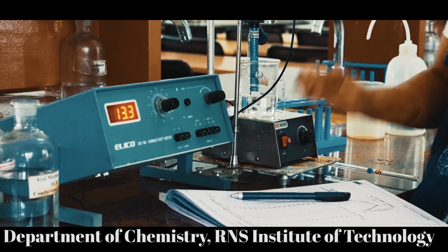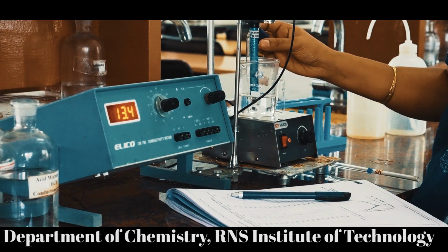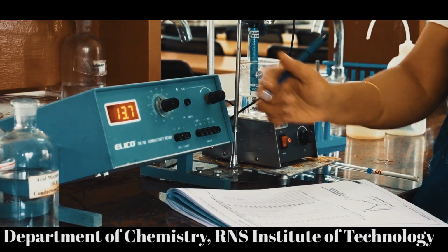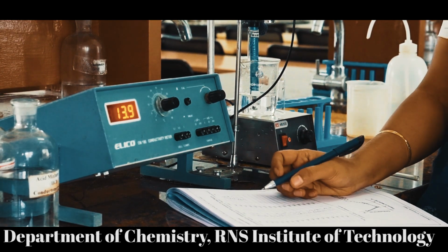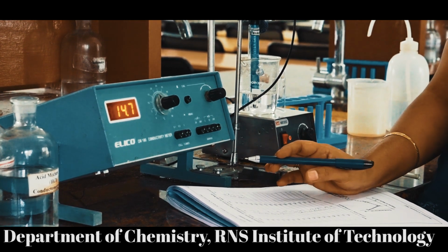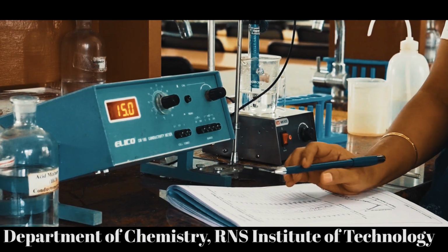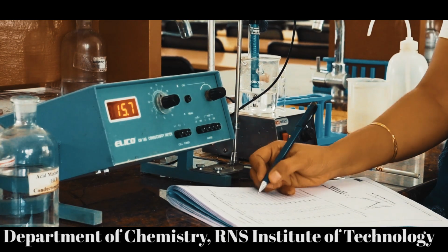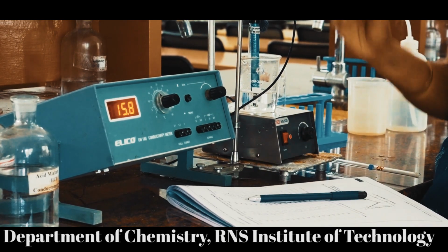It's 13.2. A sharp increase, right? From 13.2 it is increasing. If there is a sharp increase like this, it tells us that the acetic acid has also been neutralized. From 13.2 it is around 15.7. This is called a sharp increase.